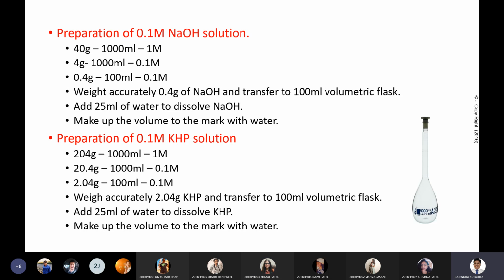And when you weigh 0.4 gram, actually 0.4 ગ્રામ એબ્સોલ્યુટલી NaOH નું આવવું જોઈએ. બટ જ્યારે આવા સબસ્ટન્સ હોય અને 0.4 ગ્રામ વે કરીએ ત્યારે 0.4 ગ્રામ NaOH બી હશે, એટ ધ સેમ ટાઈમ સમ પાર્ટ ઓફ મોઇસ્ચર વિલ બી ધેર. So that is not the accurate weight, and because of that it won't result in 0.1 molar strength. It can be 0.09 or 0.08.